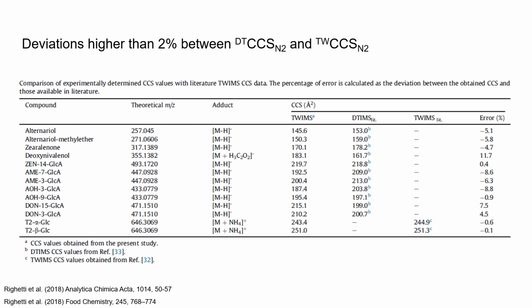Unfortunately, we don't have a combined uncertainty estimation of the CCS derived here to be able to compare precisely these values, so we assume 2% to be conservative, but based on this example, we can clearly understand that the deviations are far too high to be able to consider the CCS as a technology-independent parameter.